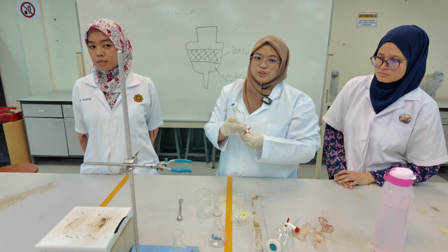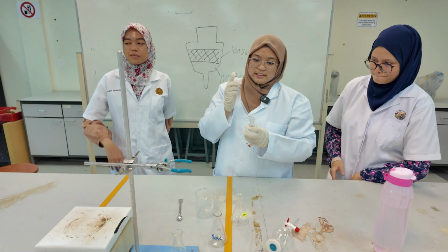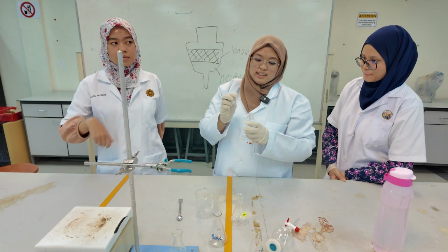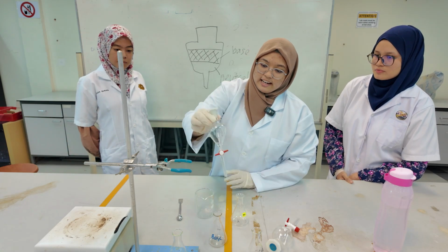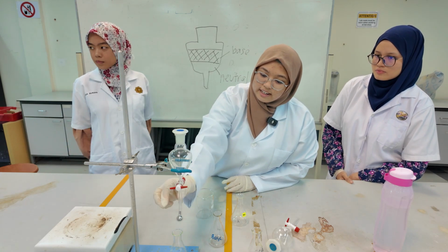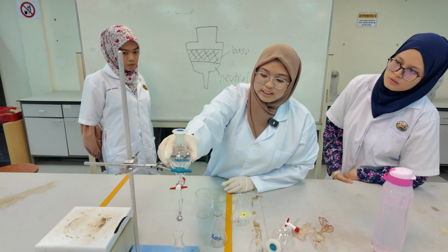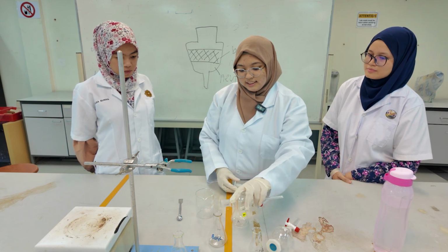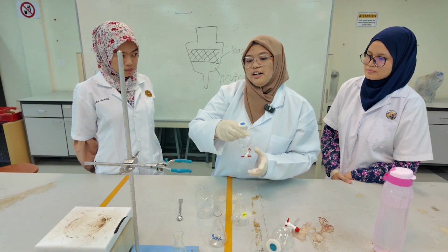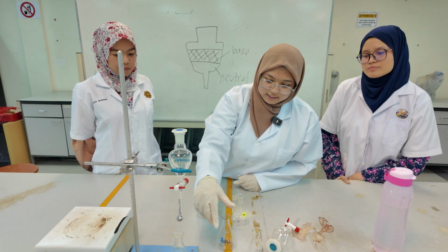And again, to achieve optimal results, we just repeat the experiment by adding more of the hydrochloric acid and remove the neutral compound. And with that, you have a pure base compound as well.